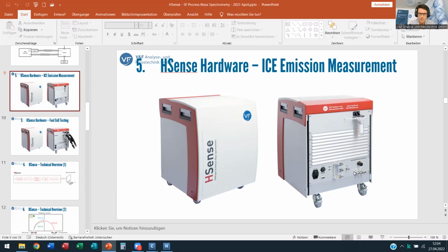This is typically done experimentally outside. You would have your analyzer and your sample transfer system, be it a 3 meter or a 9 meter line, and the run time of a signal change at the sampling point is simulated. You would connect the calibration gas to the front of the instrument in a bypass. Then you take the time from when you switch the gases to some hydrogen concentration until the instrument registers it. This is usually a delay that is implemented into the test bench. As far as I know from our customers, this is how it is done.